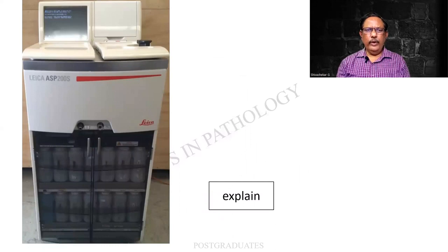Whereas this fellow is the latest counterpart of Leica itself. In this, I am not able to see the jars. I am not able to see the paraffin. I am not able to see any master plate as such. But then there are a lot of these containers lower down.